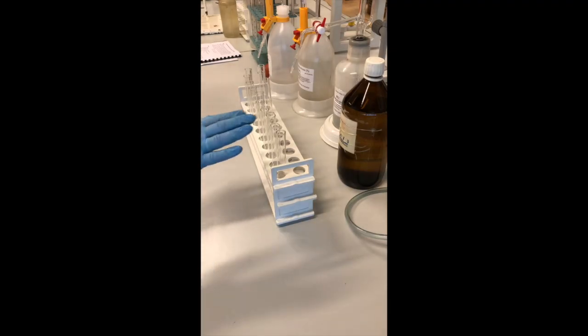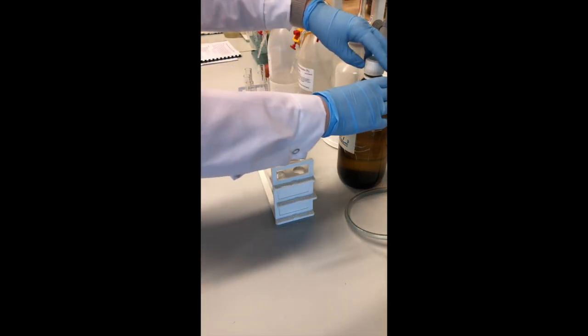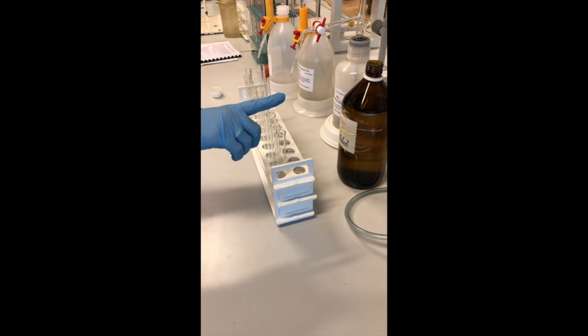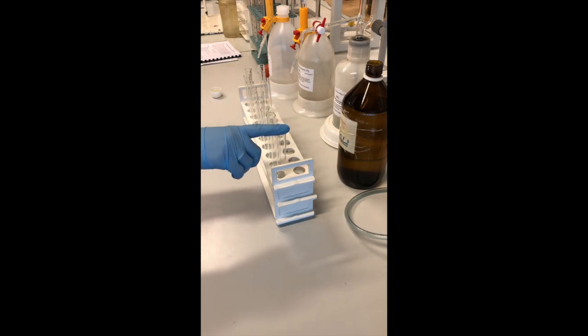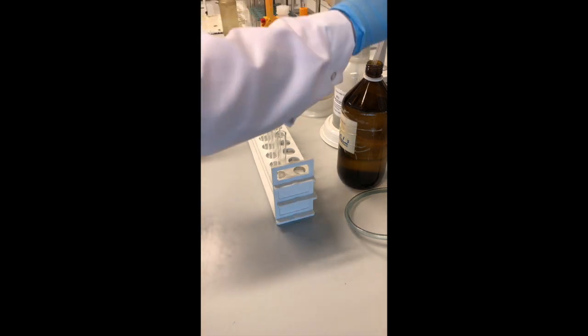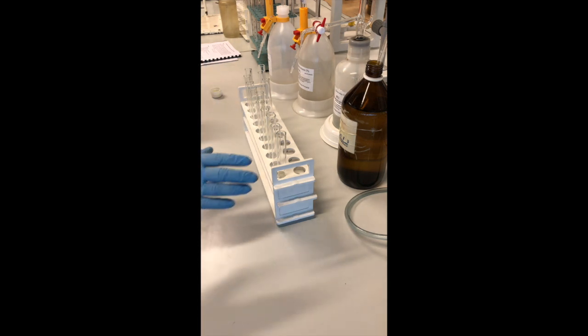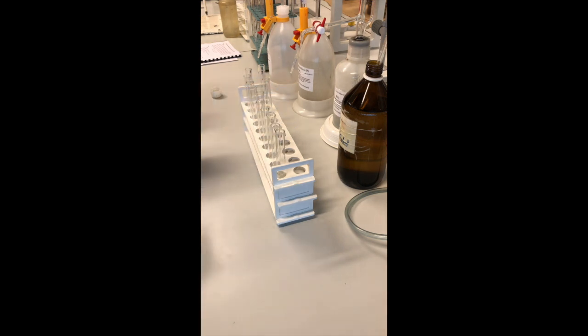The second part includes preparing the scale of standards. So you need a standard solution. To the first tube you don't put anything. To the second you put, following the instruction, 0.1 milliliter, and then 0.2, 3, 4, 5, 7, 8 and 9. So the 9th is the highest concentration, and the first is 0.